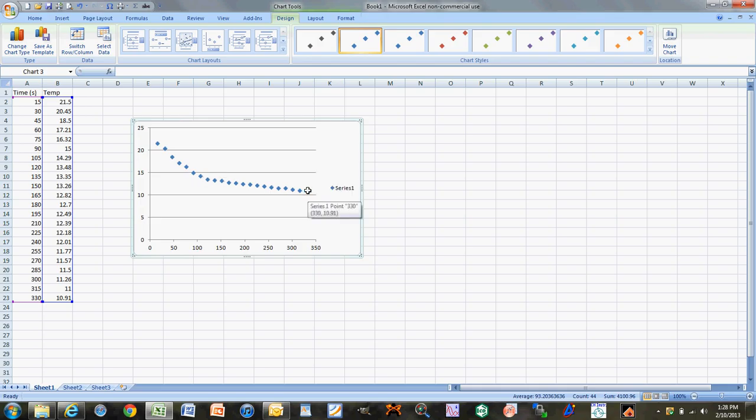So what we're going to do is break up our data into two parts. If you were doing the experiment correctly, you should have noticed a point in time where your solution became a little frosty — this is where it actually started to freeze. You were supposed to make a note of that. If you didn't, you're going to have to eyeball it at this point.